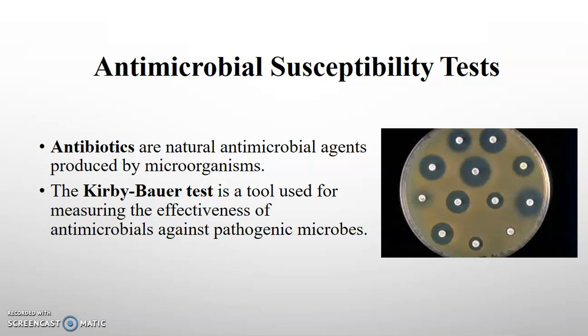So to talk about the antibiotic susceptibility test, there are several different types, and what they all do collectively is test to see if a bacteria is susceptible to an antibiotic or not, which basically means can that bacteria be destroyed by that antibiotic? Is that antibiotic effective to treat that bacterial infection? While there are many different types of antibiotic susceptibility tests, we're going to be focusing exclusively on the Kirby-Bauer test for week 5 and also for your lab report.